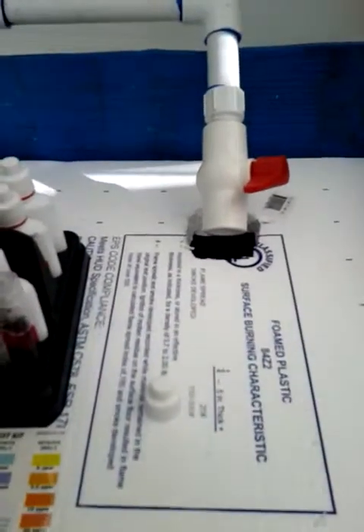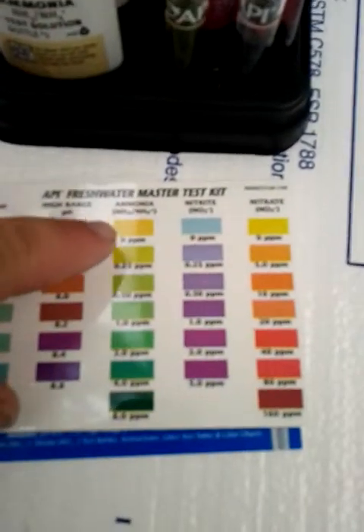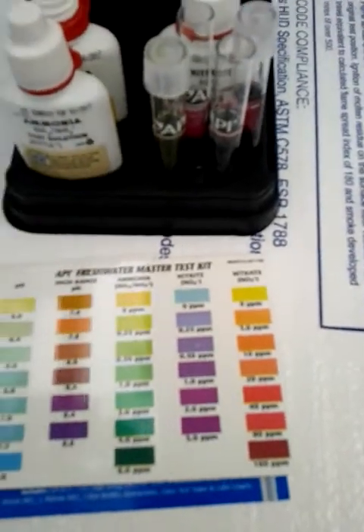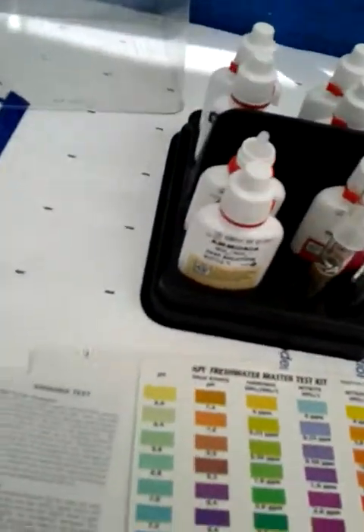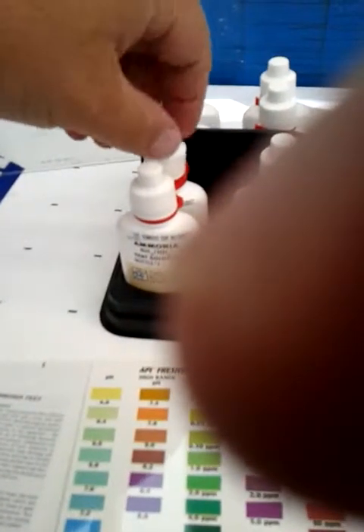So it's looking pretty yellow right now, which on the ammonia chart, bright yellow is zero. I hate to wait 5 more minutes, but not a whole lot we can do with that. I'll put the lid back on this guy.